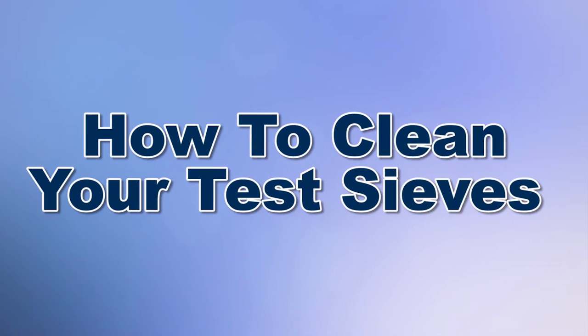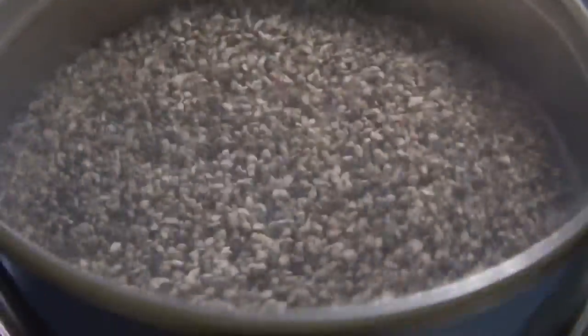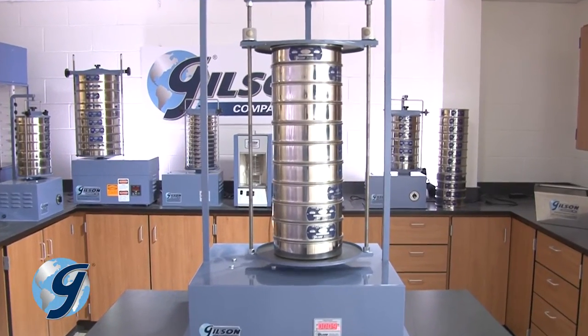Test sieves are precise instruments, and if handled with care, will last longer and retain their accuracy. Here's what you need to know before cleaning your test sieves.